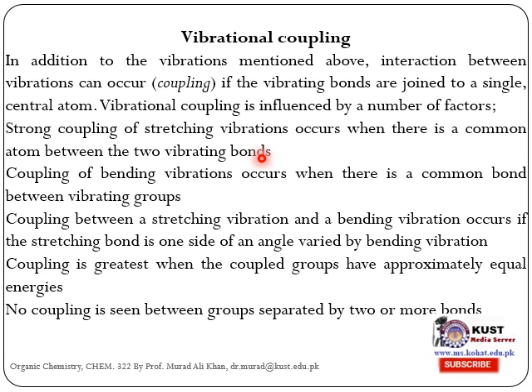Like we have discussed, there are some fundamental vibrations. These vibrations are in plane and out of plane. The in plane are stretching vibrations. The stretching are then symmetrical and asymmetrical. Then there are the bending vibrations. The bending are rocking, scissoring, twisting and wagging. And every type of vibration has its particular energy. But sometimes the two vibrations couple with each other. That may be two bending vibrations, or a bending and a stretching vibration.